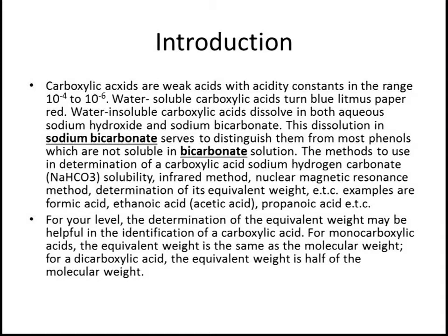For your level, the determination of the equivalent weights may be helpful in the identification of a carboxylic acid. For monocarboxylic acids, the equivalent weight is the same as the molecular weight. For a dicarboxylic acid, the equivalent weight is half of the molecular weight.